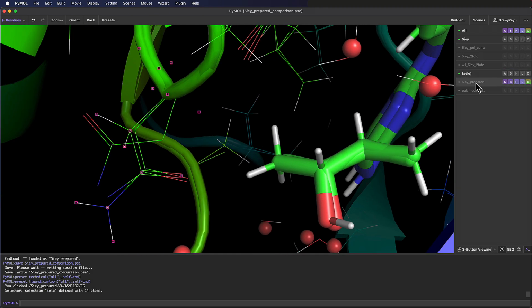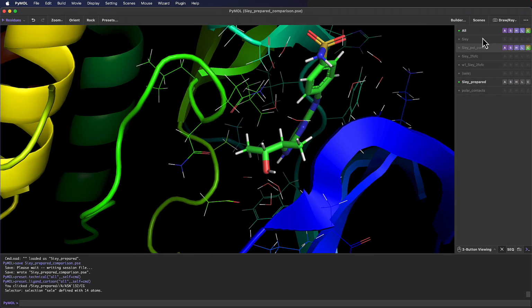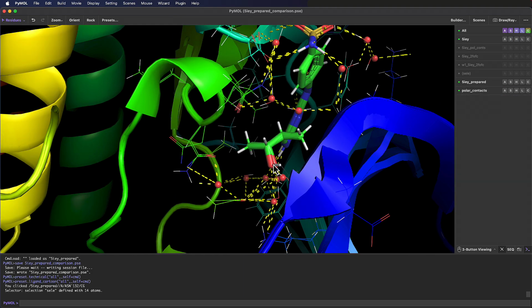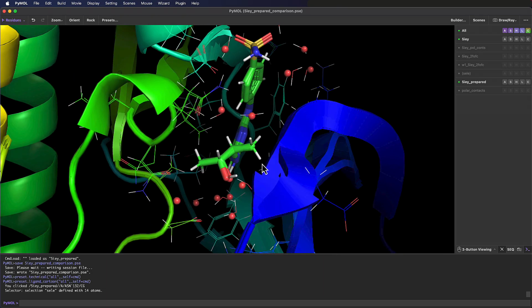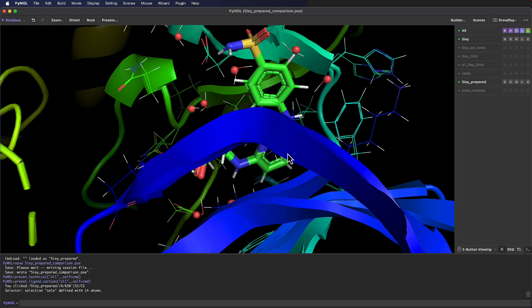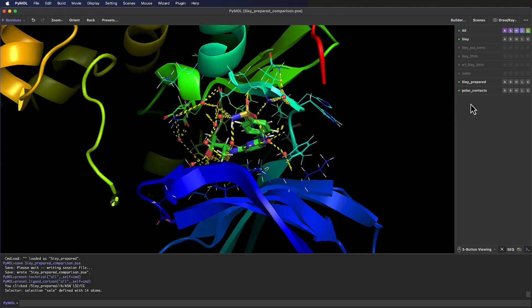Hydrogen bonds are one of the most important types of interactions in proteins and protein-ligand complexes, so adding back the hydrogens that we know should be present in a structure is often extremely valuable when we want to communicate our scientific findings. Hydrogen atoms can be added within PyMOL, but they're added according to heuristics with no understanding of global pH, local pKa, or the orientations of neighbouring hydrogens. The protein preparation workflow in Maestro, on the other hand, takes global pH and local pKa into consideration, and optimizes hydrogen bonding networks when hydrogens are added.